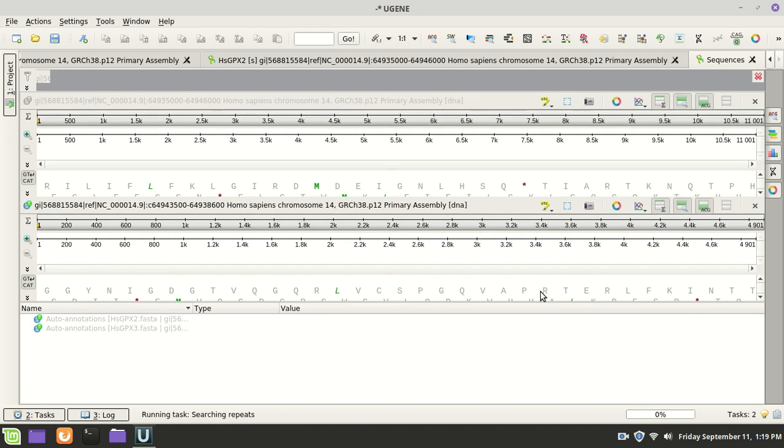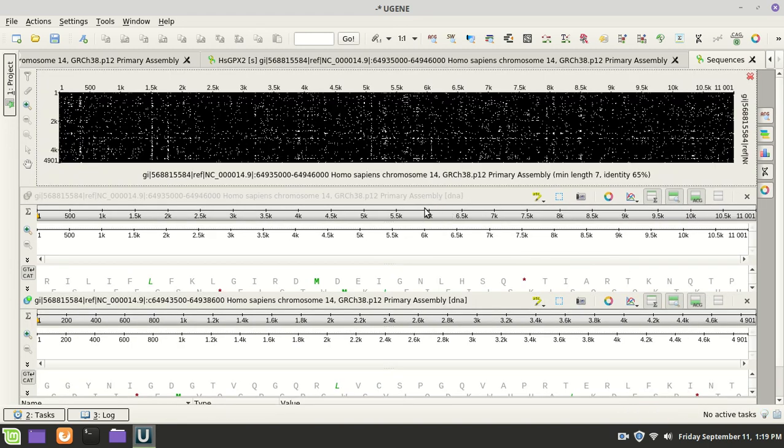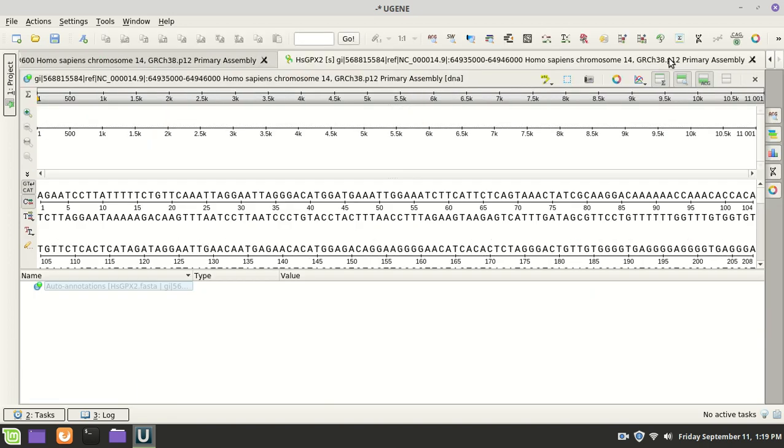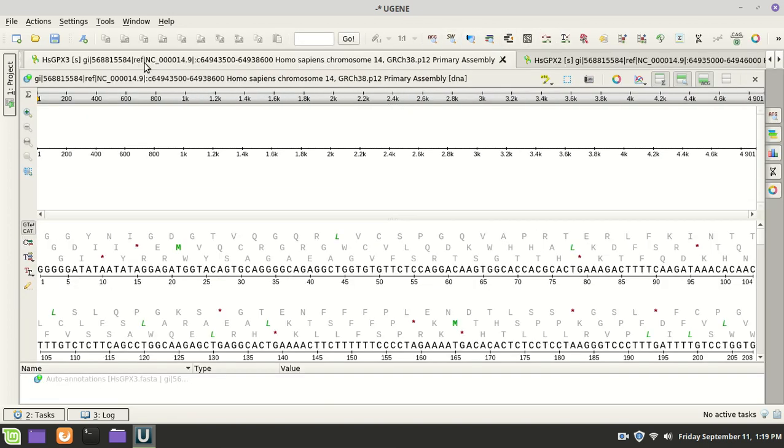So I'm going to do this. All right, and here, yeah, it's way too messy. It's almost black. It's almost solid here. So let's scroll this down. Come on. This is the dot plot, and as you can see, this should be moving. Don't know why. I'm just going to delete the whole thing there. Oh, it got rid of everything. Here we go. We'll scroll down.